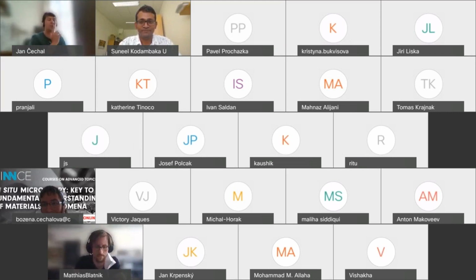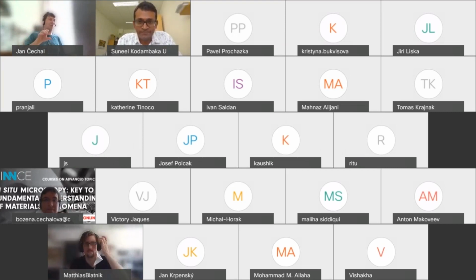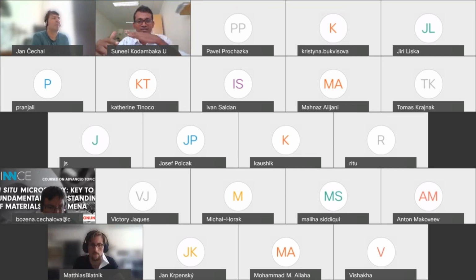I would like to ask about this change in the direction of the silicon nanowires, because you said that if you introduce oxygen, it will just change the direction of the growth. And why is it changing? It changes the wetting characteristic of the droplet, and the droplet changes its position on the tip. When you look at the tip, in all our images, we tend to visualize the interface between the droplet and the wire as a flat interface.